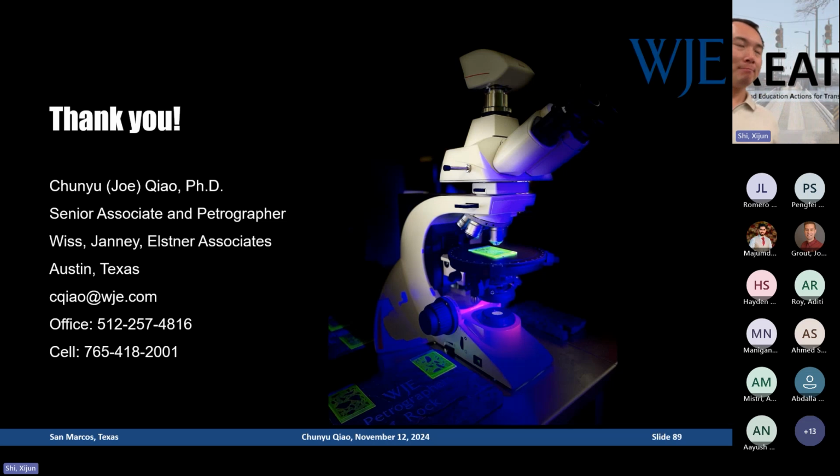I'm just curious, what if I want to create my own lab? What basic equipment do I need to purchase in order to perform very basic petrographic analysis? Well, that's a good question. I think a lot of lab preparation requirements and accessories are described in ASTM C856. But basically, you need a saw to cut your samples, water saw or oil saw, and you need a lapping machine to get a polished surface.